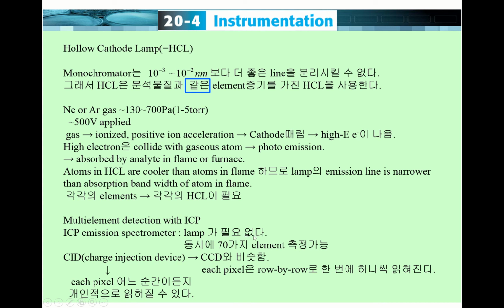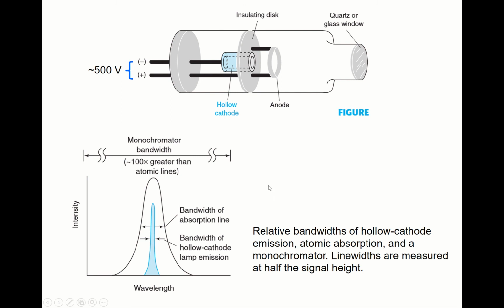An even more amazing thing is that with a charge injection device, a two-dimensional display is possible. The principle of a CID is very similar to a charge coupled device. I will explain in more detail later.